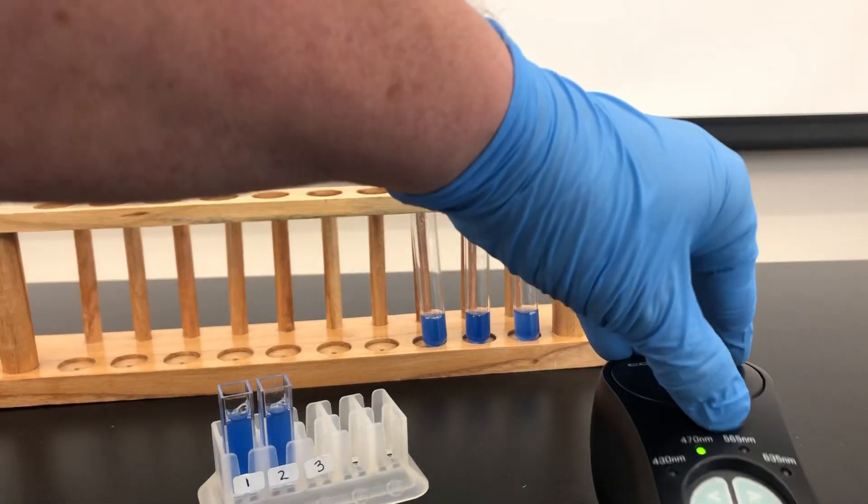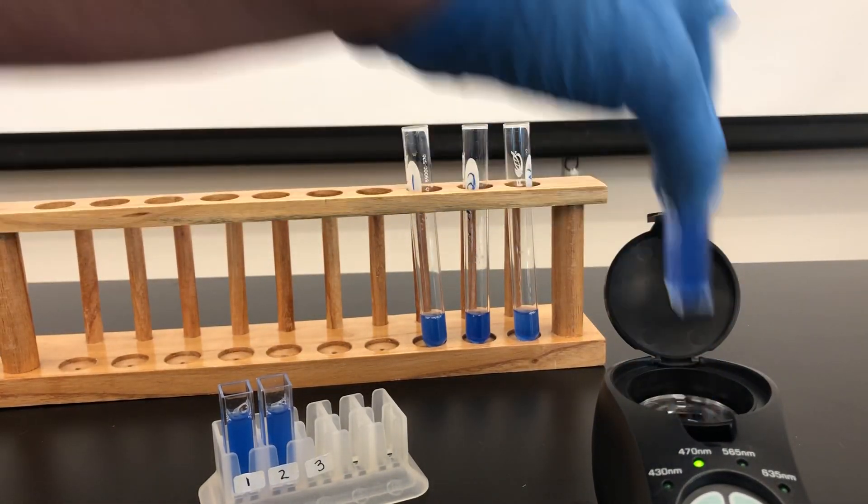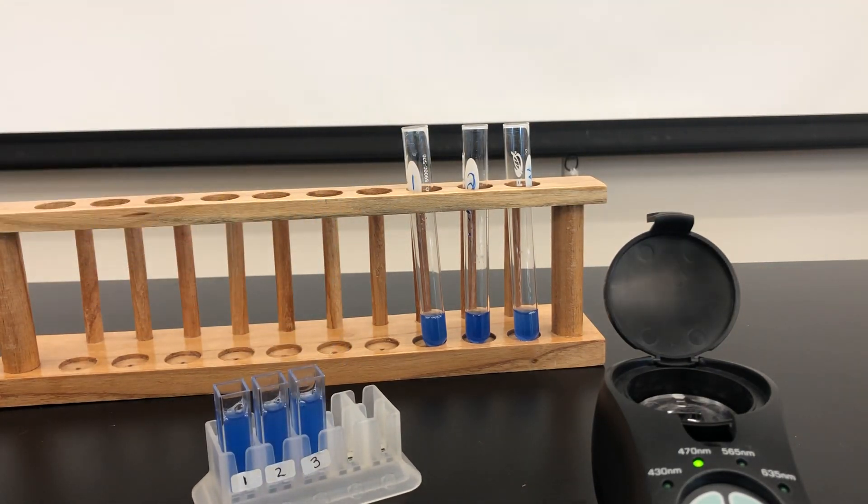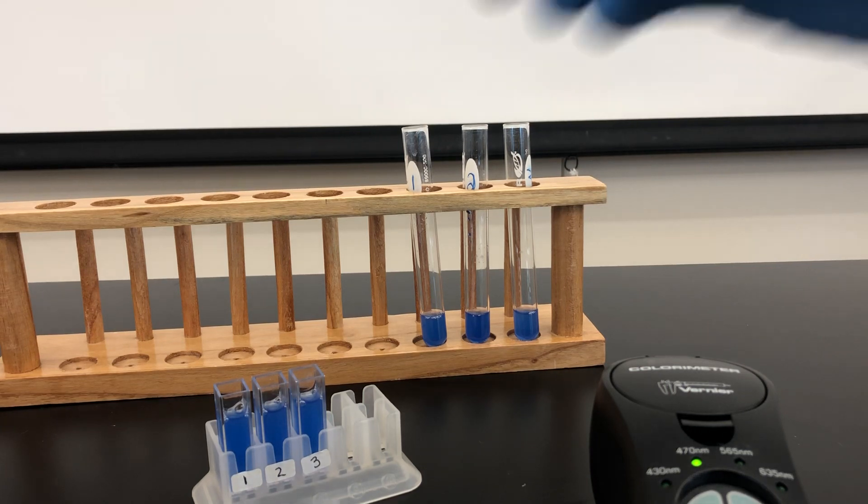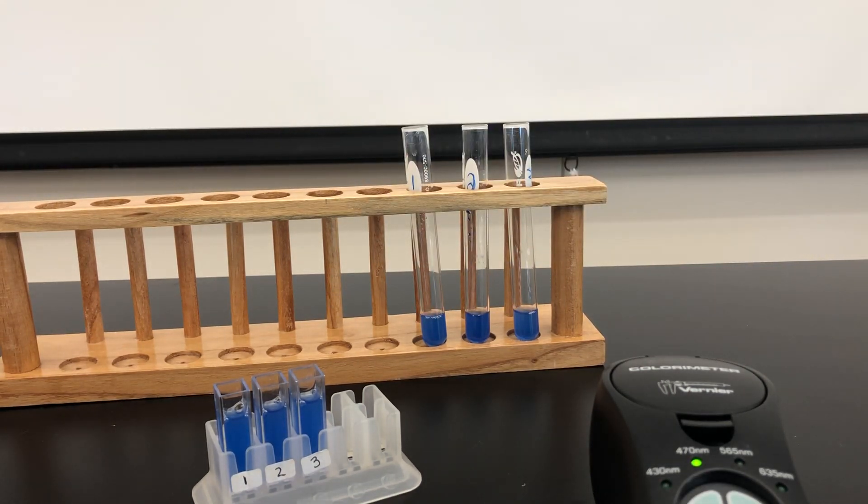Now remember what these values are trying to tell you. If this is the percent absorbance, that's the amount of light penetrating but not leaving. So the more it absorbs, the darker the color. The less it absorbs, the more light is getting through, so it's a lighter color.